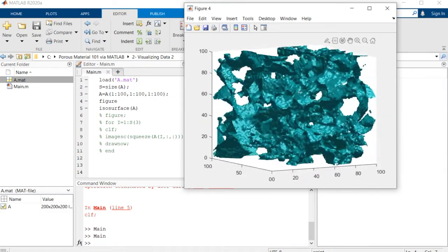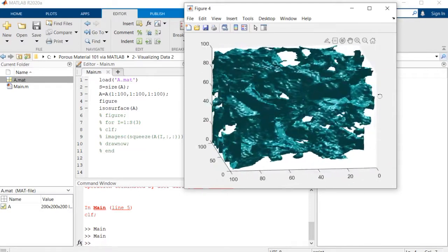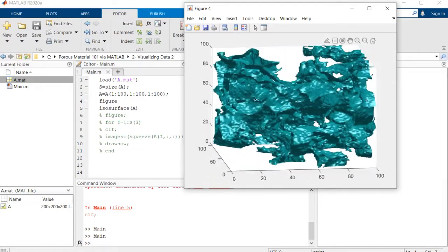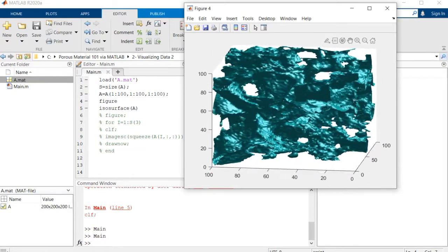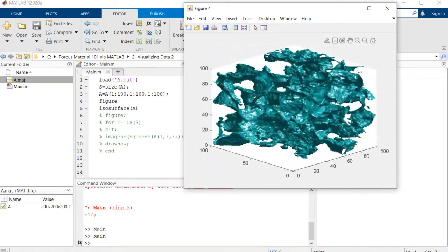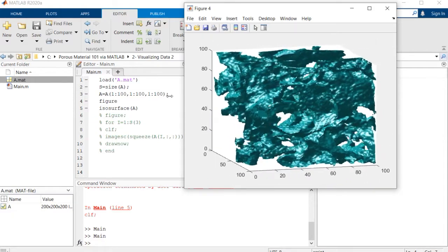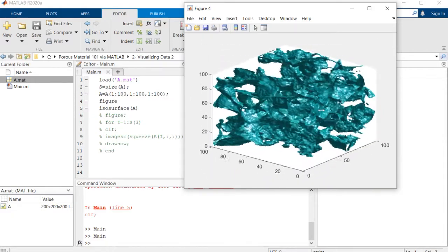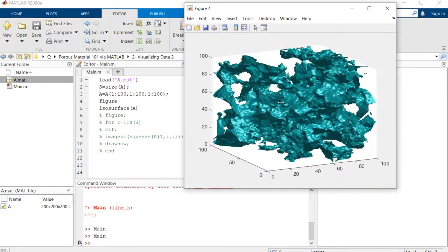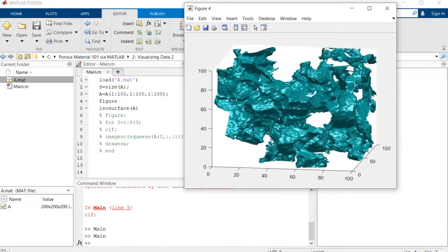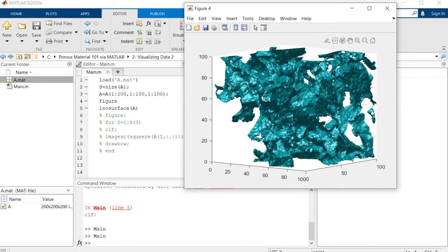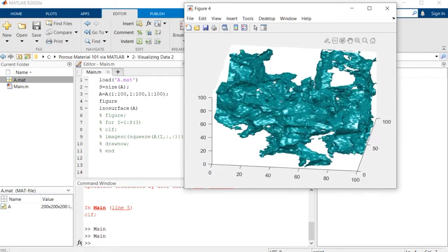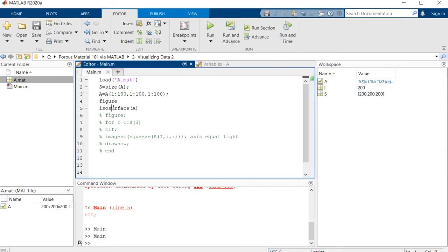This is the porous space that we have there. The problem is that this porous space looks a bit strange because it's only a surface. It only shows the surface of the structure because it's isosurface.